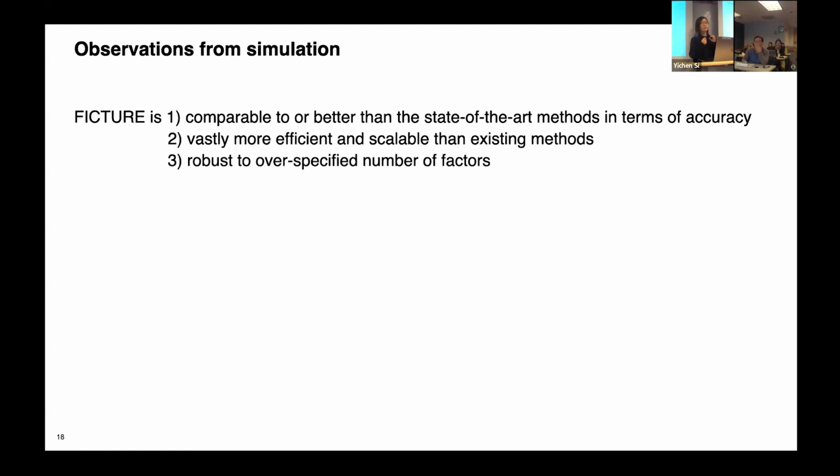If you have bigger cells, that's easier for sure. Even if you have smaller cells, but they tend to be located in a homogeneous region, then the problem is still easier because your effective cell size is bigger. But if you have smaller cells that are intermingled with smaller cells from a different cell type, or smaller cells in between bigger cells from a different cell type, then that's a difficult problem. We acknowledge that.